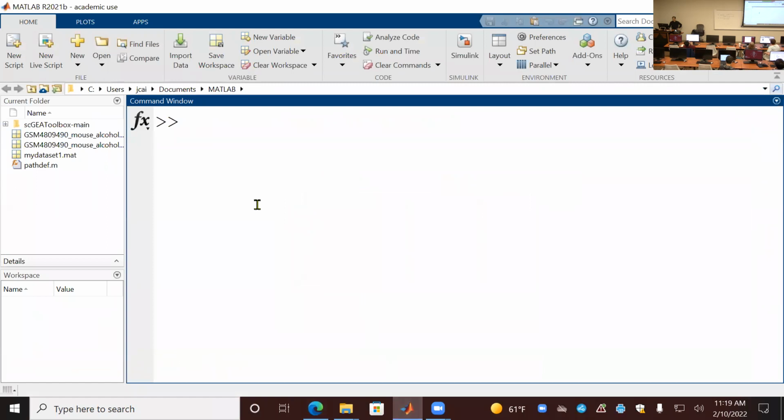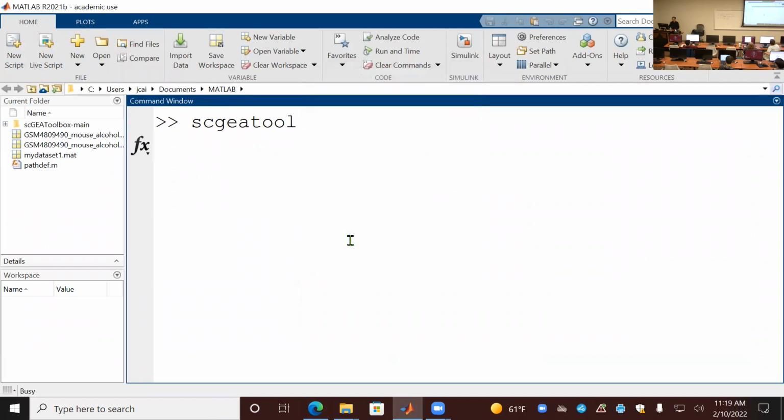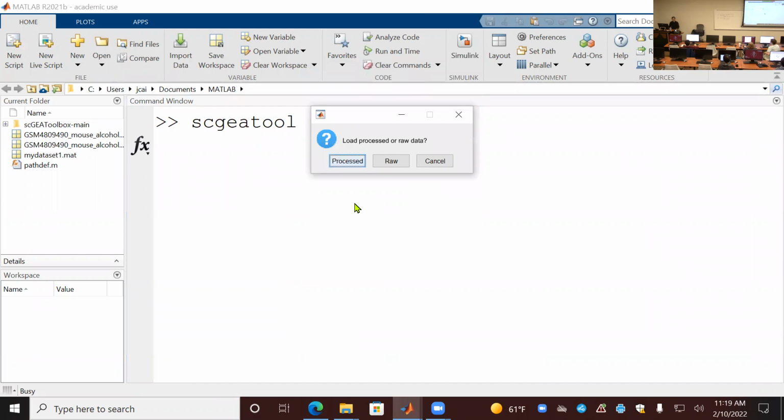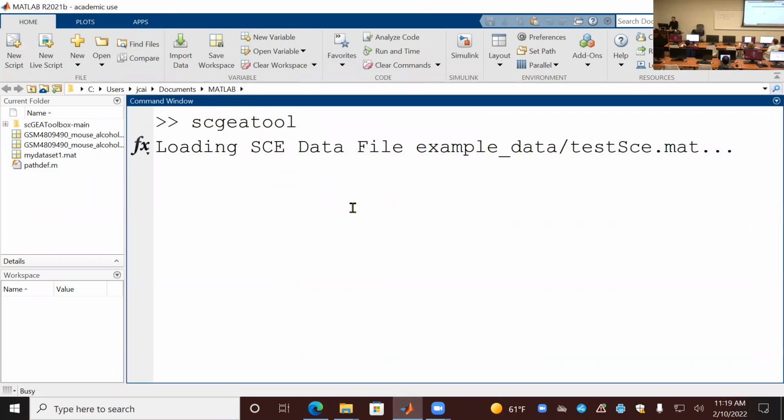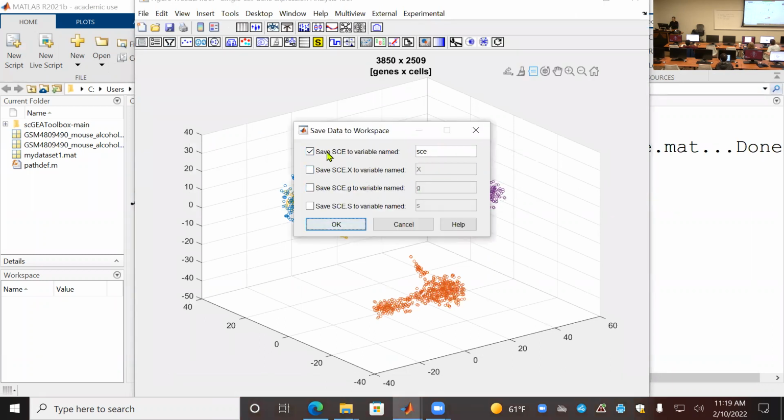Let's get example data in there. So what you can do is to use this example data. Okay, we can load this because we need this X matrix. So you load this data and then export. Here, this button, you can export the data to workspace. We don't need SE, we need big X, right? This is the matrix, and you need a list of gene name. So once you export these 2 variables, you will be able to see them in the workspace.